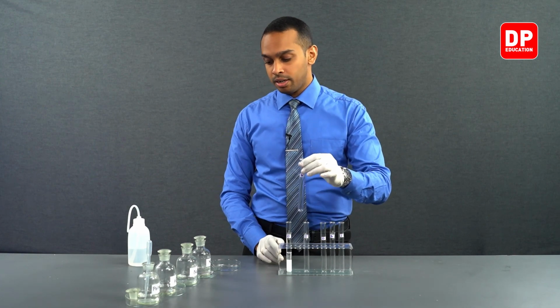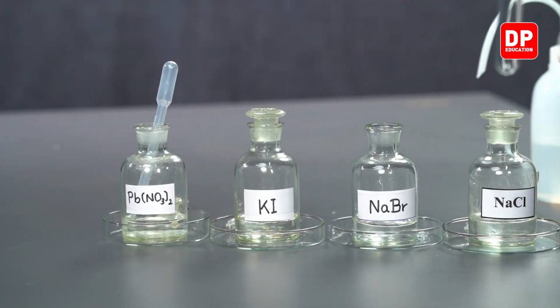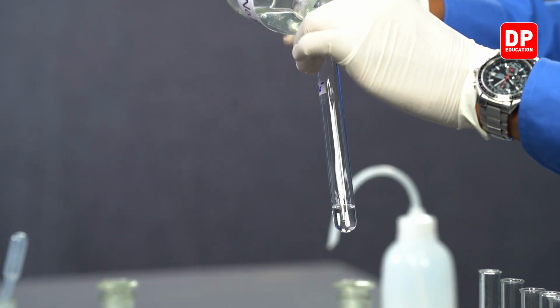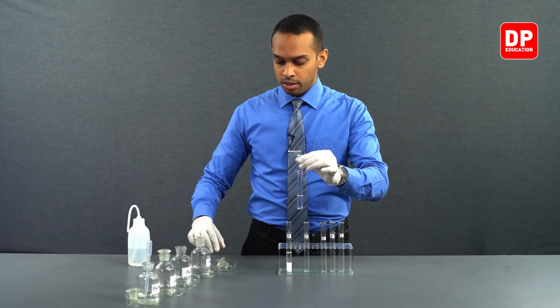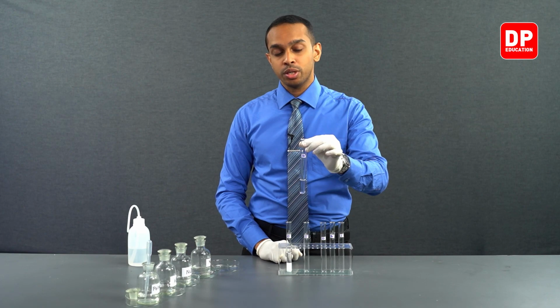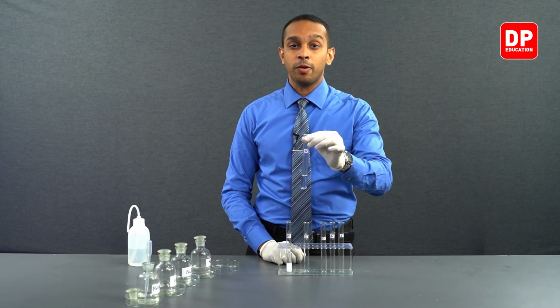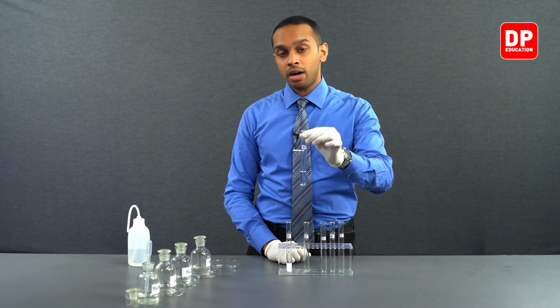We will take another test tube labeled bromide ions, and we will transfer some of the sodium bromide into this test tube. Now, students, I have a little bit of sodium bromide solution over here. In this solution, we have sodium ions and bromide ions. We are mainly carrying this test out for halides, so the bromide ions are the main focus.